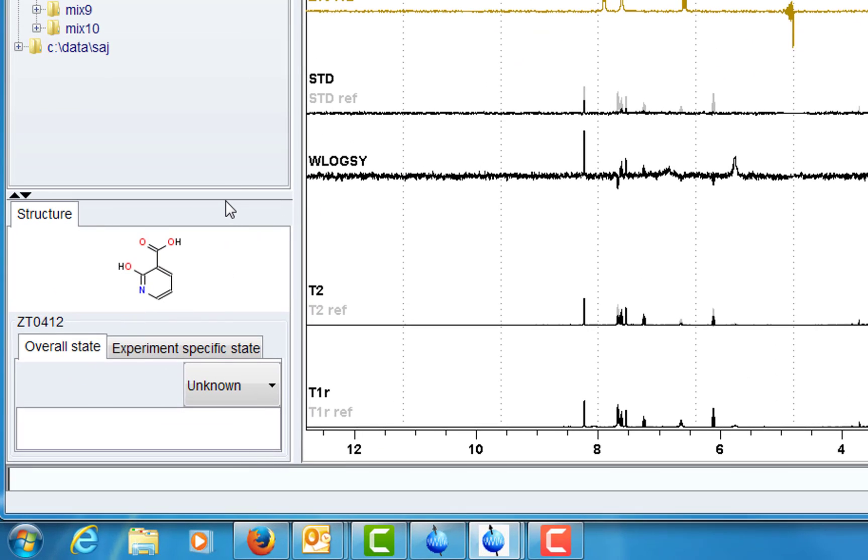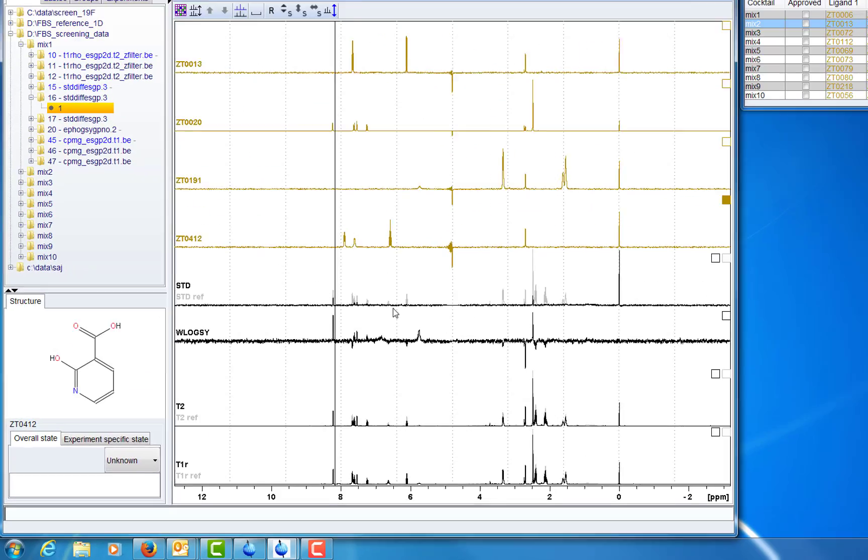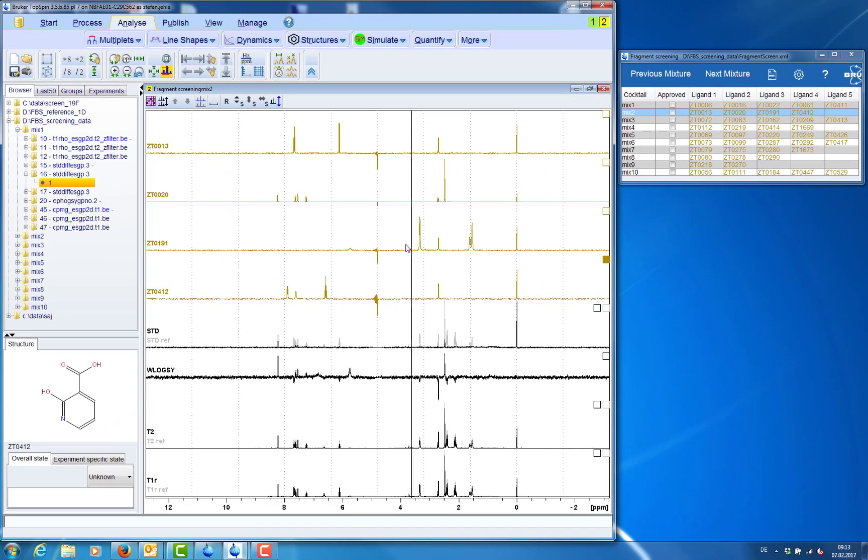Now if we click on a compound we will see the structure if the mole file has been stored with the reference 1D data.